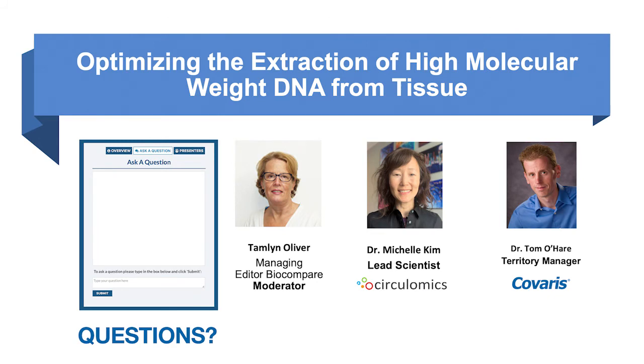What percentage of the reads that were sequenced were over 100 kb? That depends on the tissue type, but generally about 5 to 10% of the reads were above 100 kb. And there are ways that we can push the library prep to get more reads at more than 100 kb. We are also currently working on protocols to increase the size of high molecular weight DNA that you're getting from tissues.